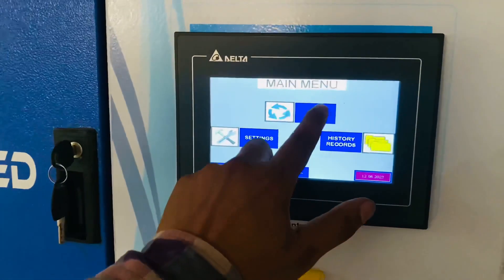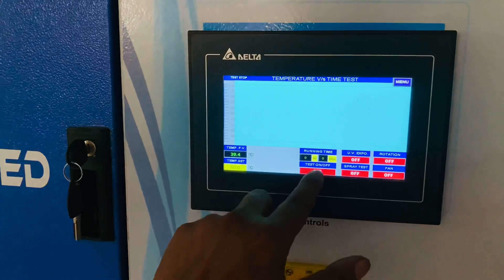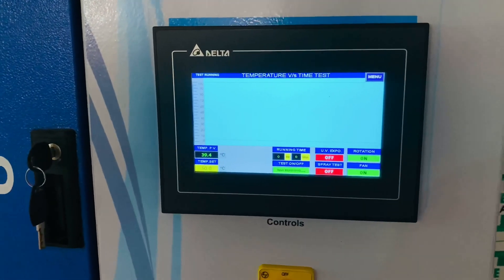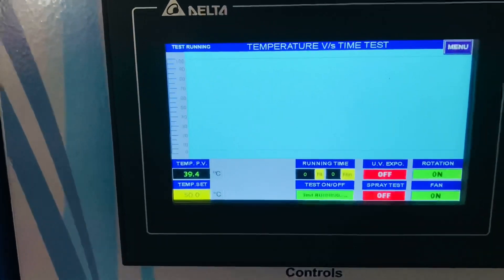After setting up the test program, click the button start to start the test. The HMI displays the current operation of UV exposure, water spray, and hot fan.